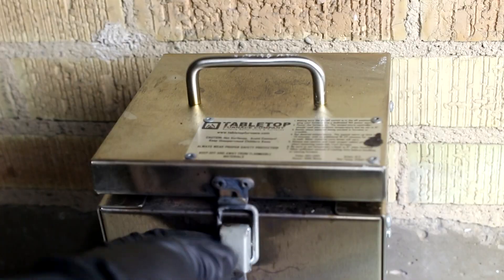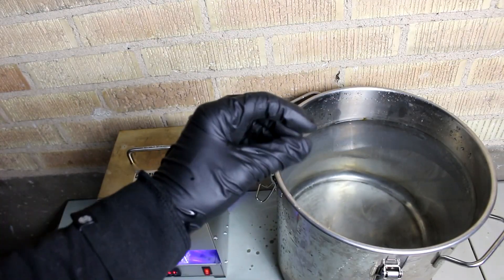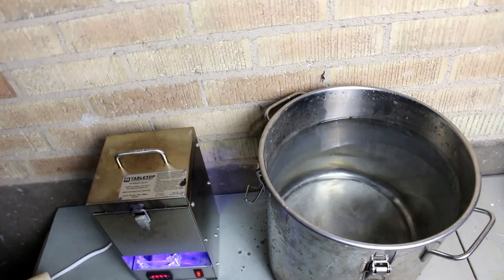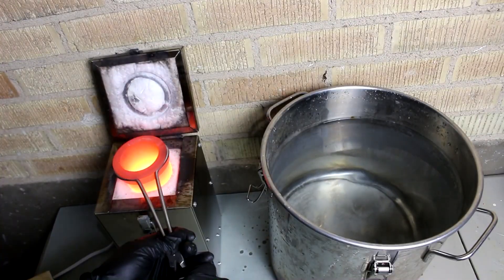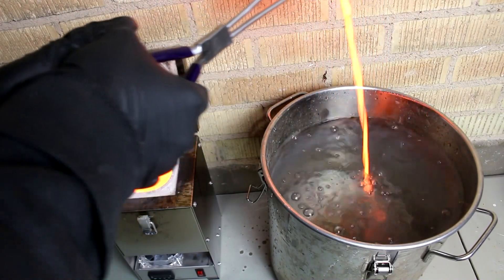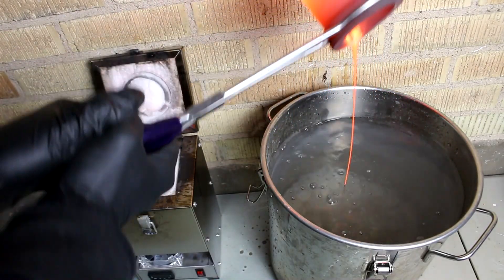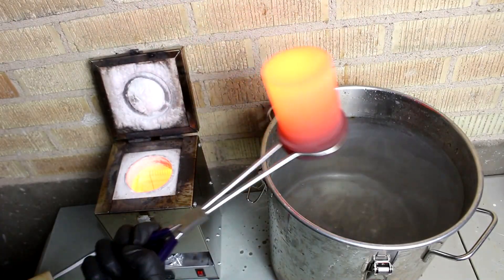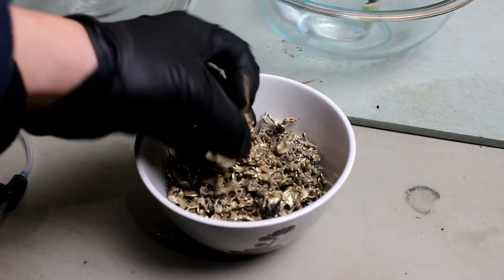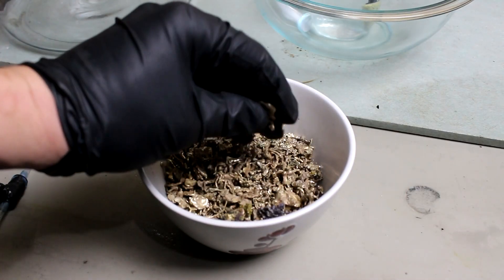Let's let that come up to temperature again and we'll pour it out. I'm going to be pouring it into this bucket of cold water. That way it breaks up into little tiny pieces to make it faster to dissolve in the acid. So here's the material all turned to shot — you can see when it hit the water it kind of splattered, increasing the surface area so the acid can get at it more quickly.